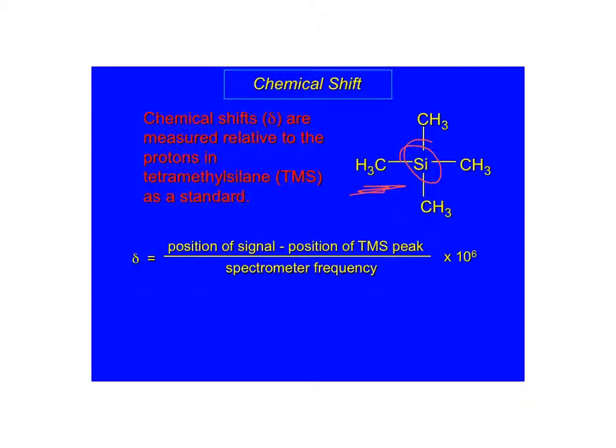All right, so this is tetramethylsilane. I don't expect you to know its structure, and I will call it TMS from here on out. But whenever I have you draw your own spectrum, I do expect you to put in at 0 the little peak for TMS for both carbon and the proton NMR.